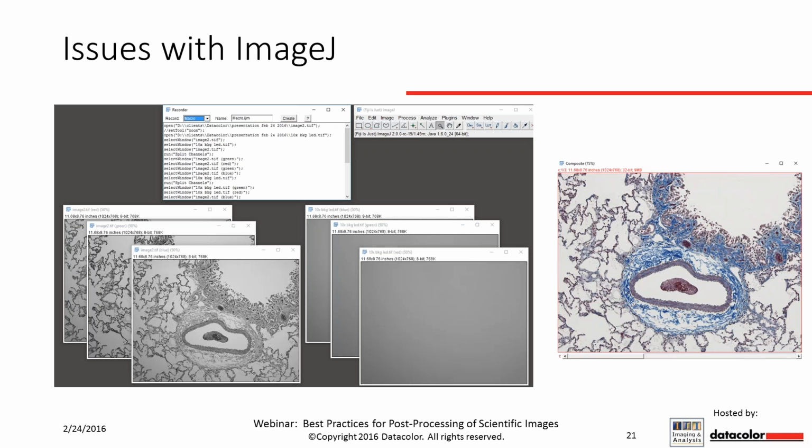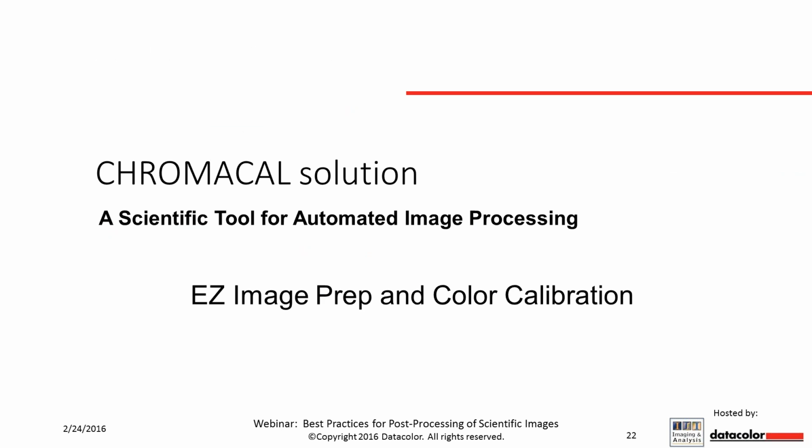Here's an example of actually doing a white balancing technique according to a technique that I found on the web, and it requires that you split your image into 3 separate channels. This also does uneven illumination correction, and there on the right you can see that the uneven illumination correction was accomplished along with white balancing, but it was rather a complex process and time-consuming.